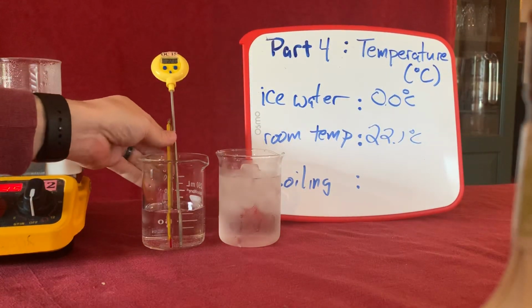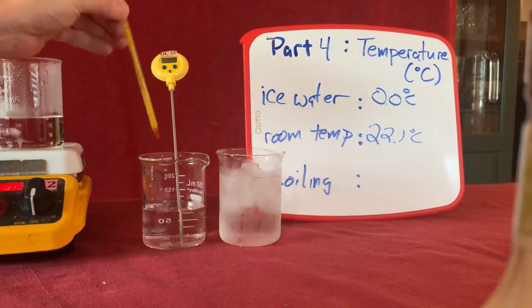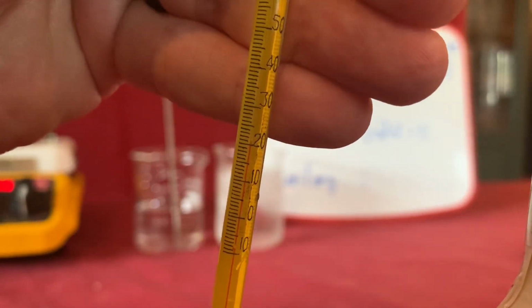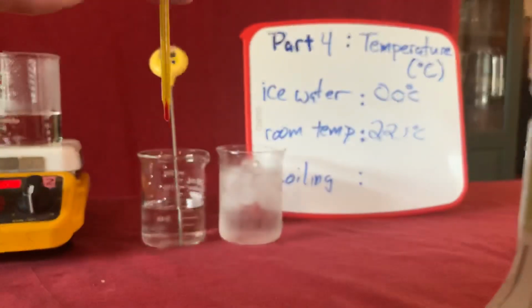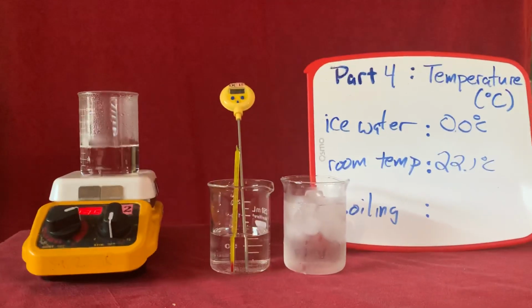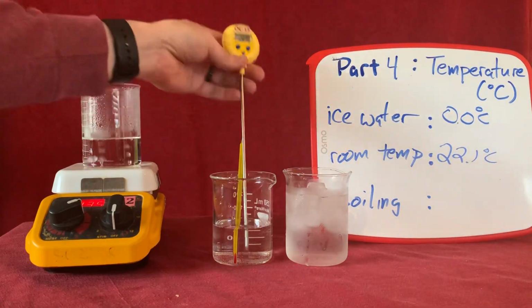The analog thermometer has the exact same amount of precision. It's a little more difficult to read. We read this just like we'd read any of our volumetric glassware, seeing where that red line falls between our 2 measurement marks. Now our final sample is of our boiling water, which I have pre-boiled because watching water boil is boring.